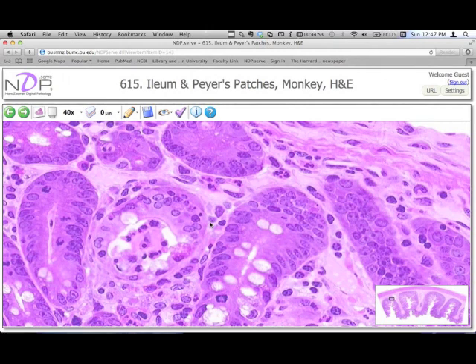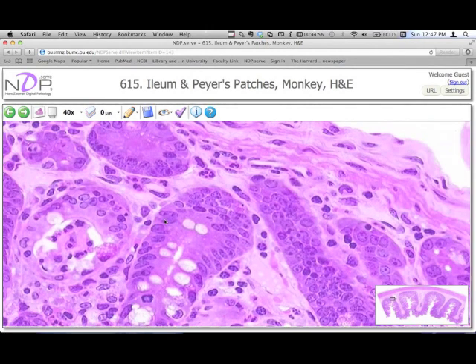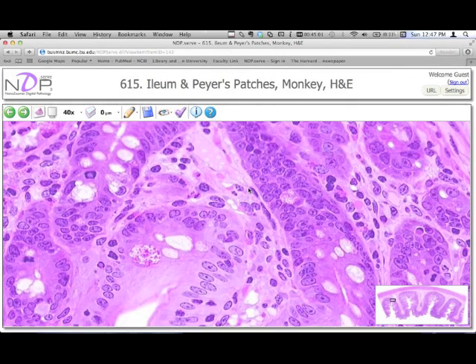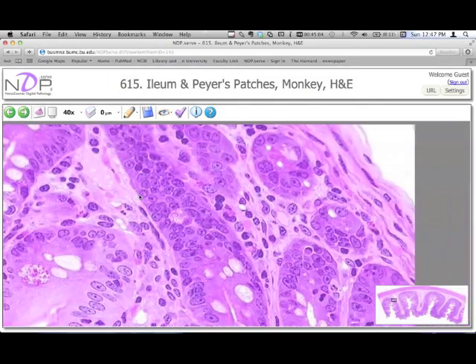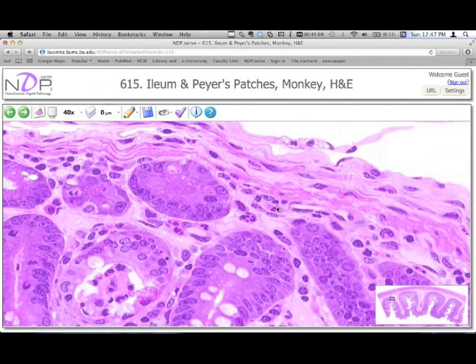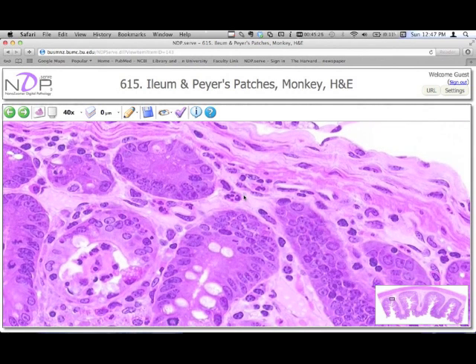So what we're looking for in an eosinophil is a cell with multiple lobes. And, well, once we know what multiple lobes are, then we are in a better position to make that distinction. Another cell that has multiple lobes, fairly numerous, is a cell right here, and this would be a neutrophil. And here's one lobe, and here's another lobe. So reasonably small, heterochromatic, and within the same cell. And we see one here too. There's 1, 2, 3 lobes. This is a neutrophil.